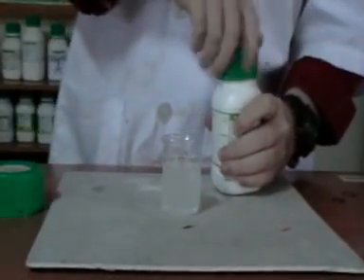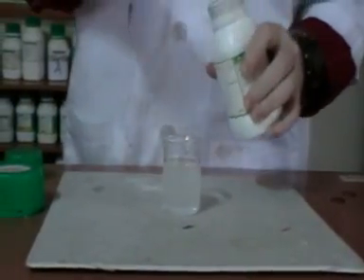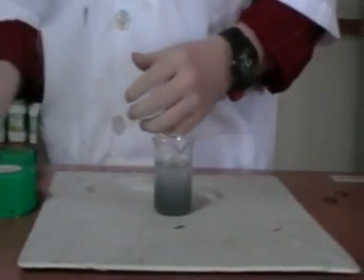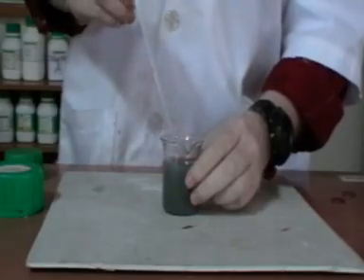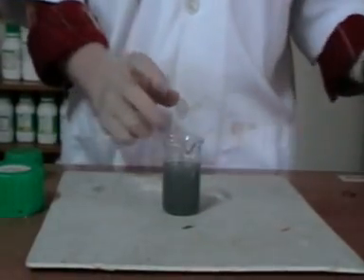We add zinc powder, and then we put - or we add - a copper coin. And then we boil the solution.